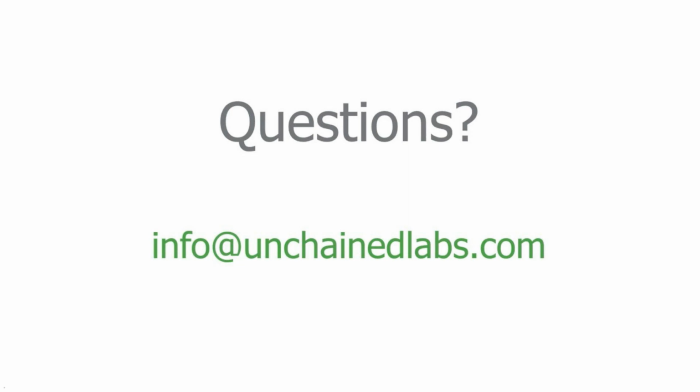All right, and our next question asks, can I do this kind of test if iodixanol is present? So this is an interesting one. It was a result that we didn't really expect when we started testing out these samples.